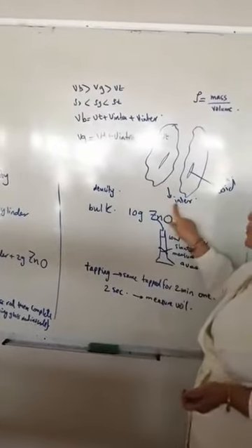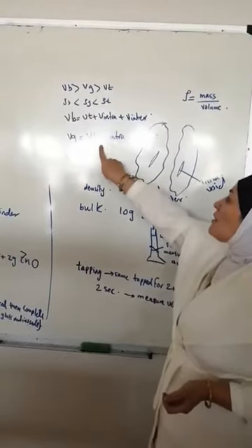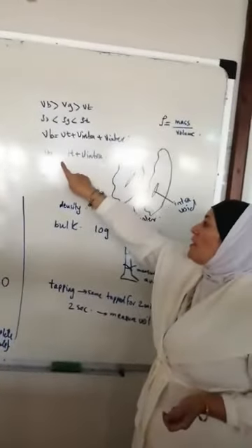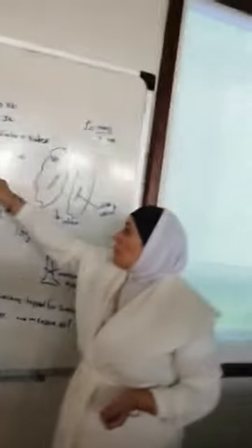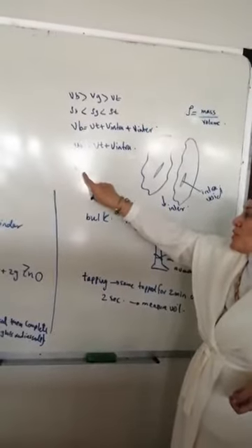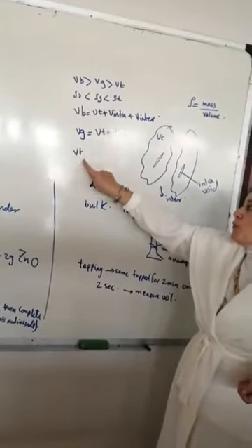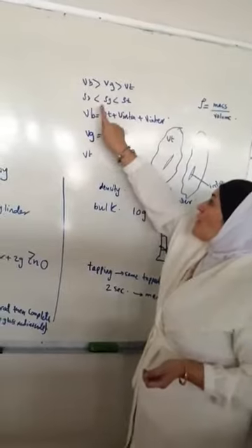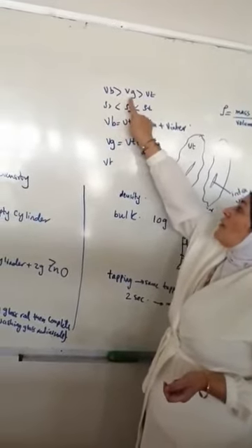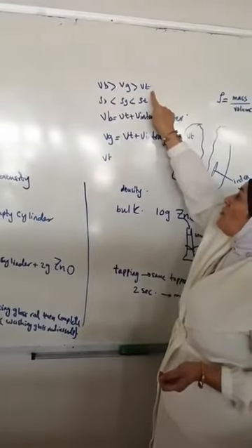If we exclude the volume of intervoids, we get the volume of the true powder plus intravoids, that is the granular volume, and the stable and constant volume, which is the volume of the powder itself, the true volume of the powder. If we rank the volumes, the bulk volume is the largest, then the granular volume, and the smallest and constant volume is the true volume.